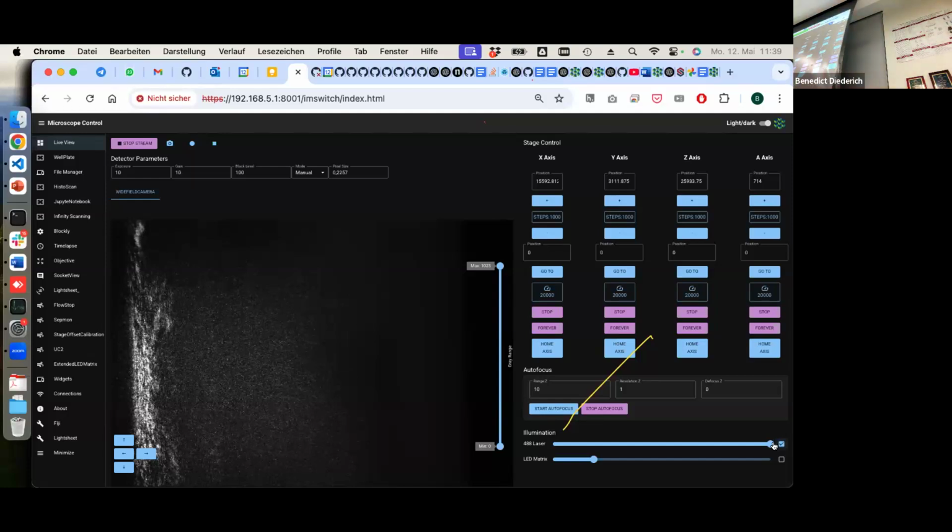So let's collect ideas. We had optical tweezers. There's this optical component with some people on the left and online as well. We're trying to design a CO2 sensor with wavelength modulation spectroscopy. Okay, so I think we could do it with your purification process. That's very good. I'm not quite sure how this setup looks, but I can show you later. But I think we could do it.